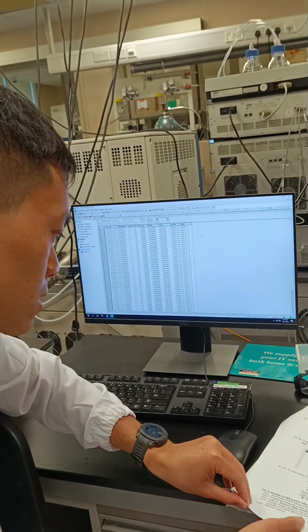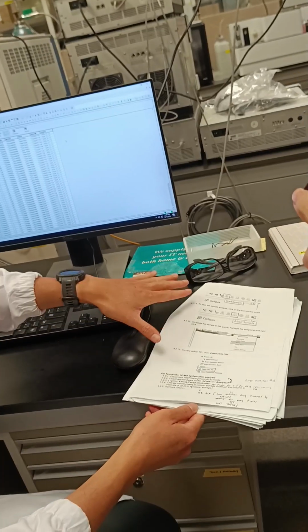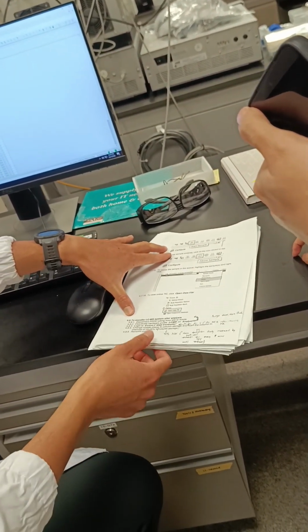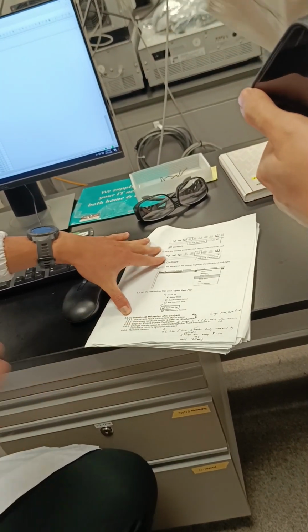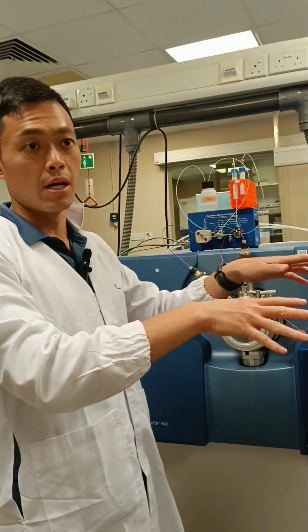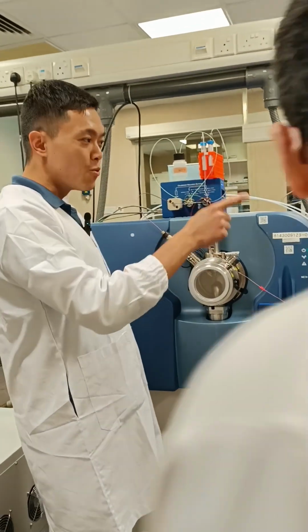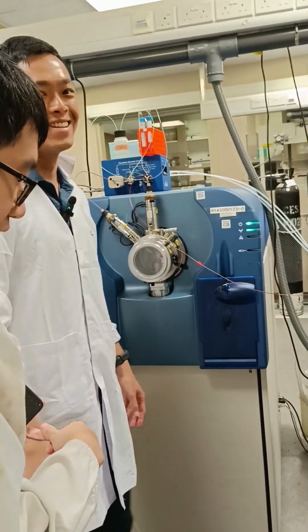So that's the next thing that you might need to be careful about. Everything here is for after you're done with your experiment, I mean, the machine is done with the run, then to standby the LCMS after analysis. The very first thing you need to do is to disconnect this PEEK tubing. Because every time after you run every batch, the first thing you need to do is probably clean your machine, right? But before you start cleaning your machine, you have to make sure this one is disconnected. Otherwise, all the dirty things, all the contaminants will go in here. Then once it goes in, that's it.